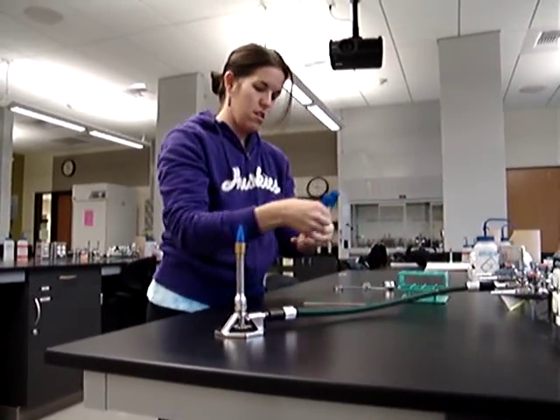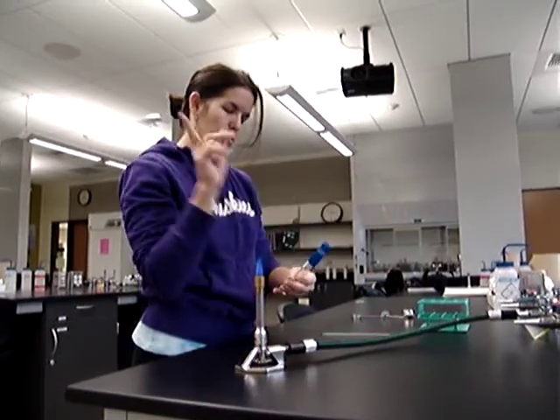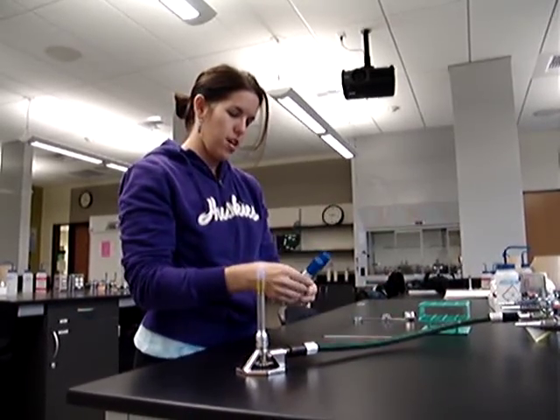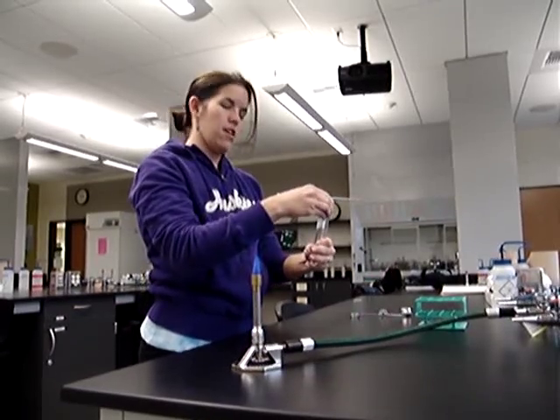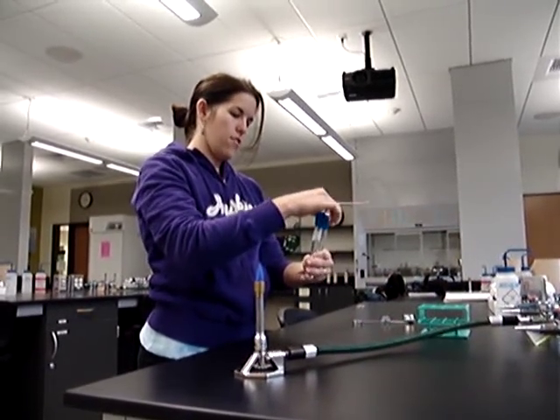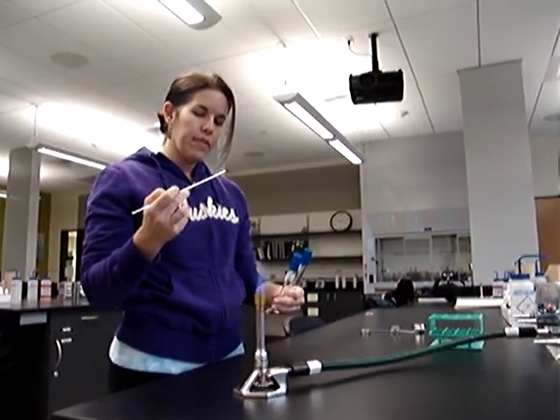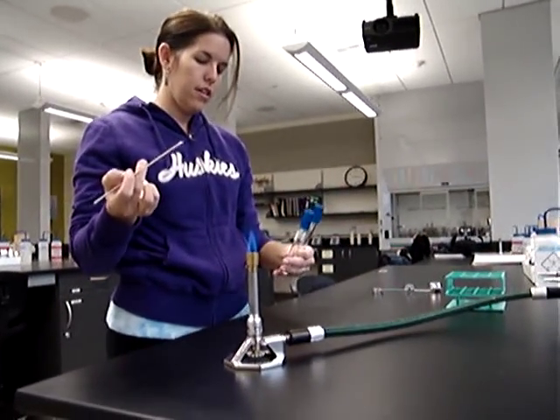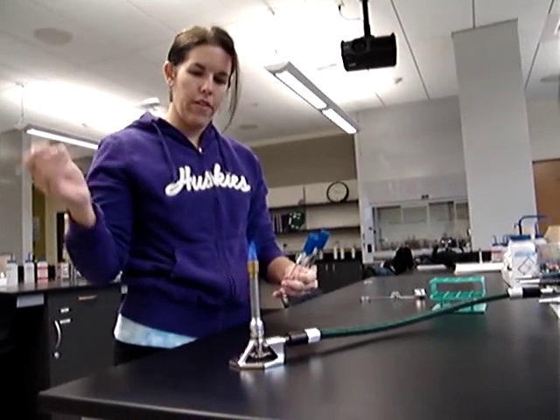How are you doing today, Jennifer? Good — I just want to get this done, so can you be quiet for a minute so I can concentrate? Okay. You've got to go at an angle, because you'll get bacteria in it if you're not at an angle — remember?